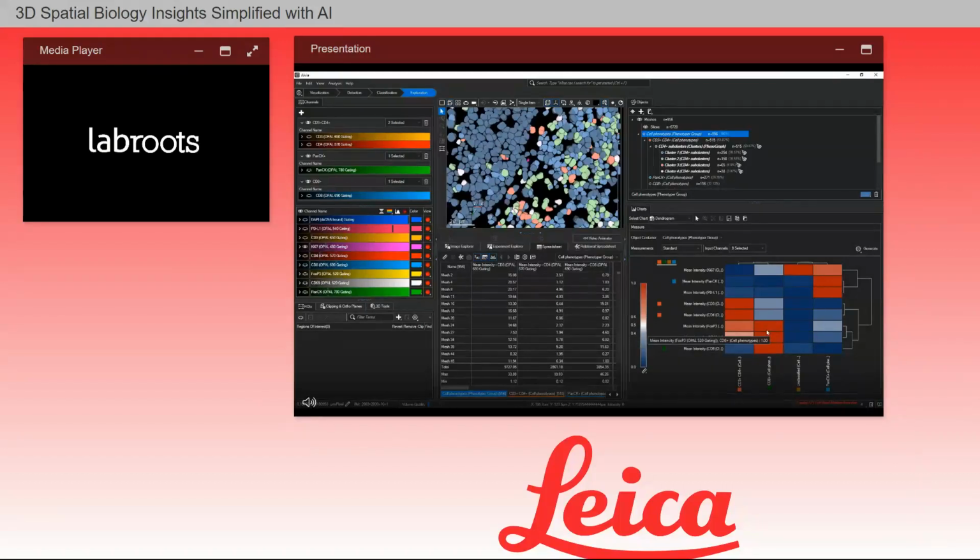And looking at the tiles, you can potentially infer the interactions between different biomarkers. Take pan-CK, for example. In this cluster, we can see that it is high also in PDL1 and Ki67 mean intensities. In cancer biology applications, we often see pan-CK co-expressed with PDL1 and Ki67. This could be indicative of pro-tumor activities happening in the tissue microenvironment.